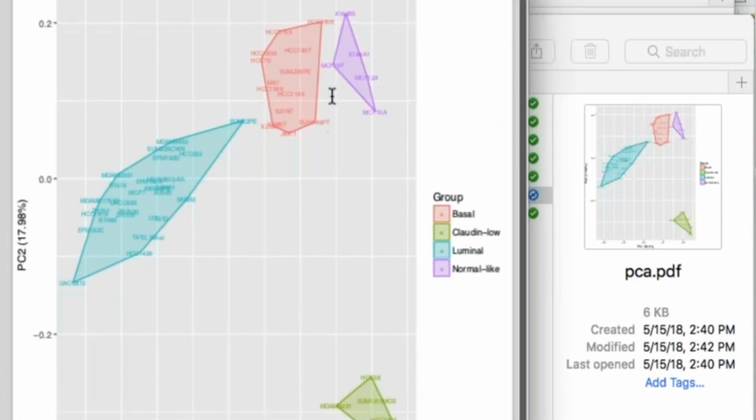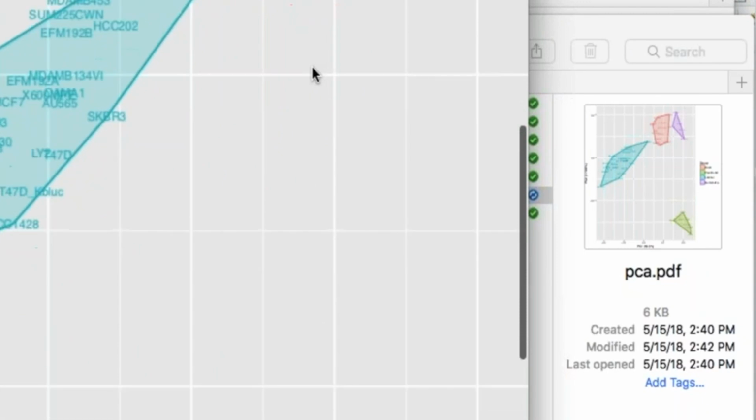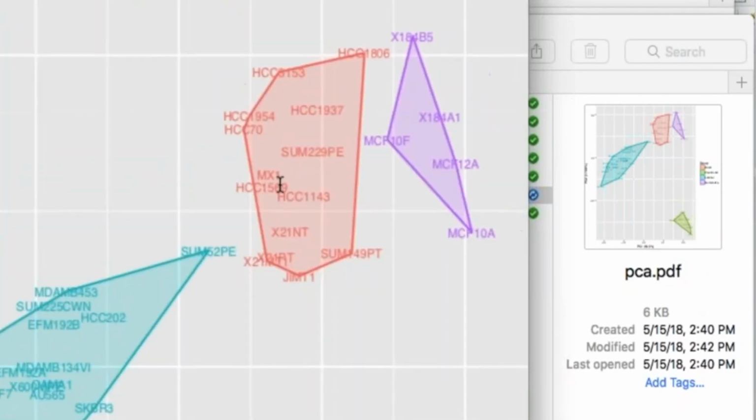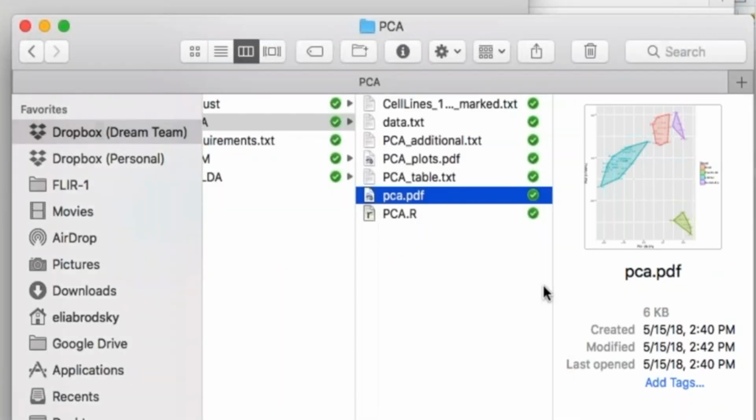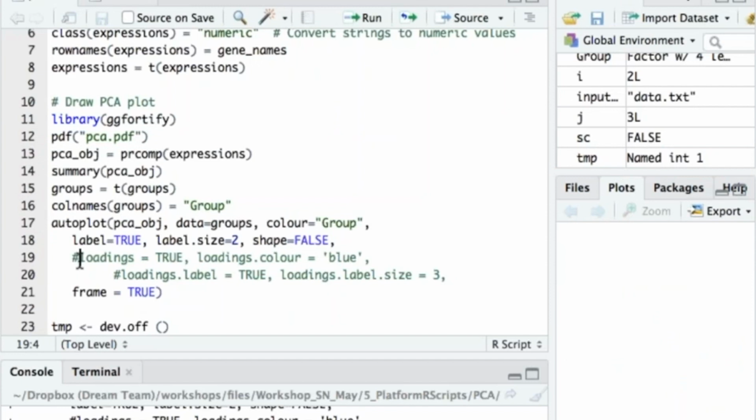And you see that we have polygons instead of ellipses. Okay, and I have commented some other options which are perhaps hard to understand because some have mathematical meaning, but let us uncomment these strings and see what will happen.